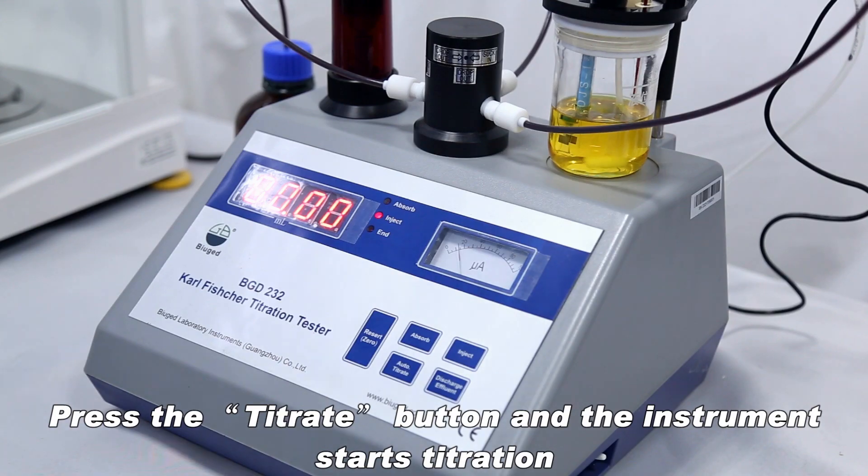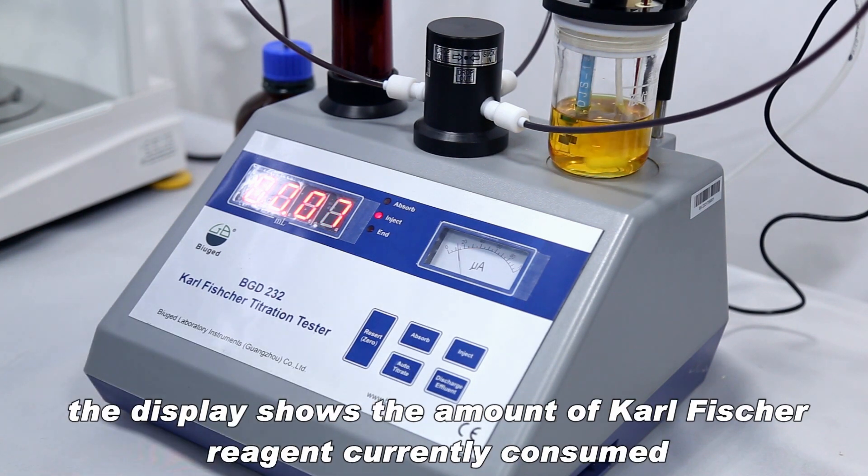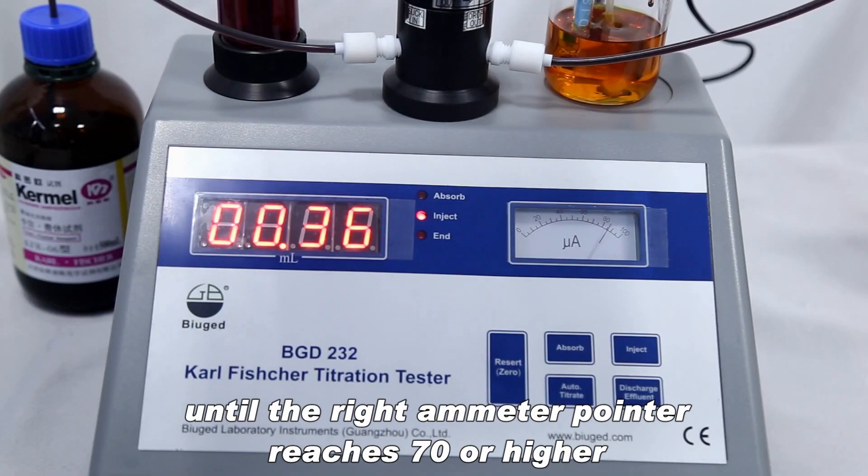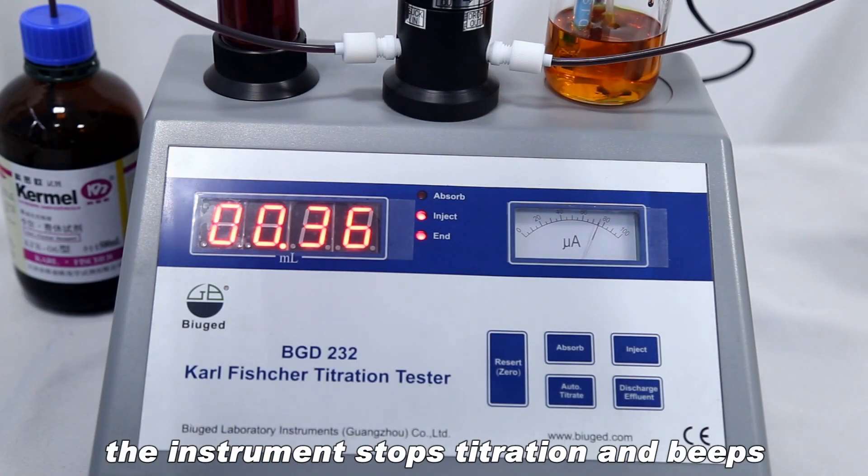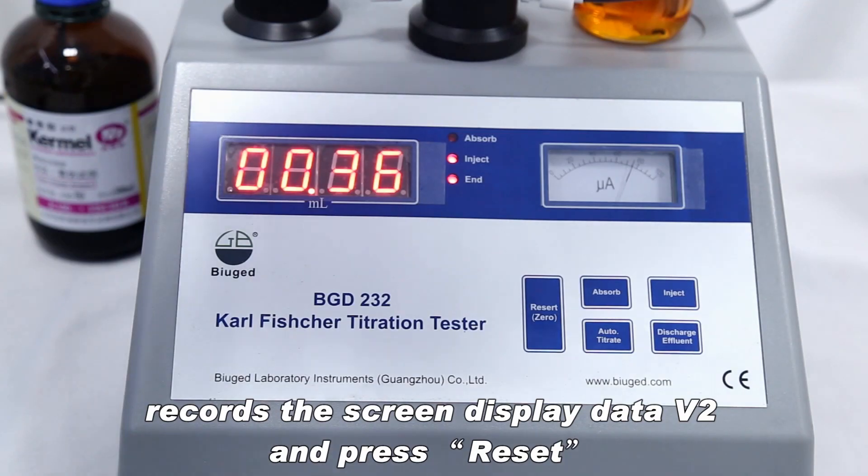Press the titrate button and the instrument starts titration. The display shows the amount of Karl Fischer reagent currently consumed until the right ammeter pointer reaches 70 or higher. The instrument stops titration and beeps, records the screen display data V2, and press reset.